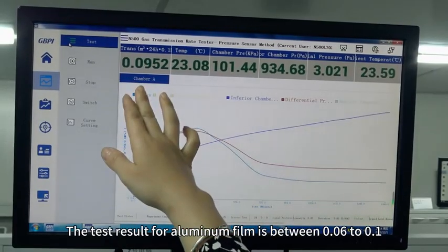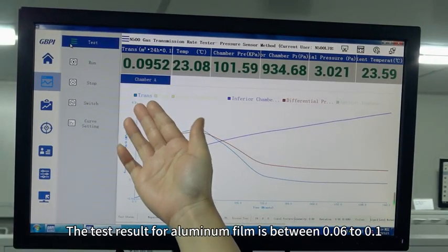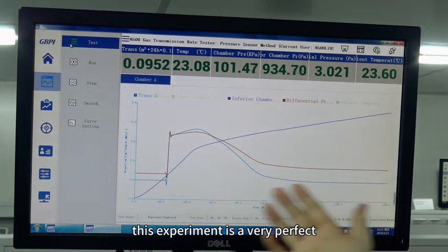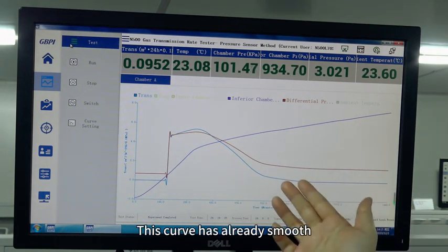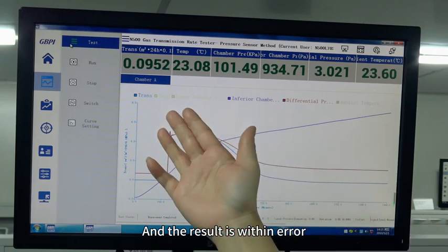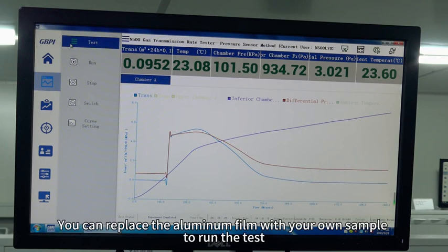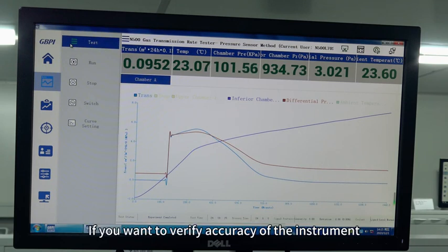The test result for the aluminum film should be between 0.06 and 0.1. This experiment is very good — the curve is already smooth and the result is within error, which indicates that the instrument has reached the testing state. You can now replace the aluminum film with your own sample to run the test.